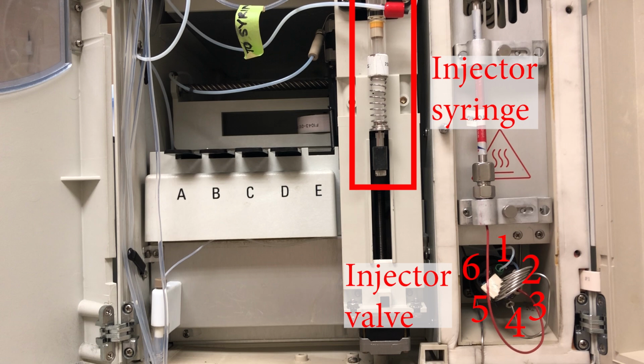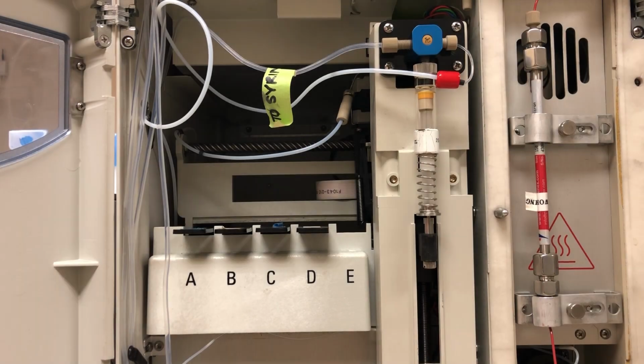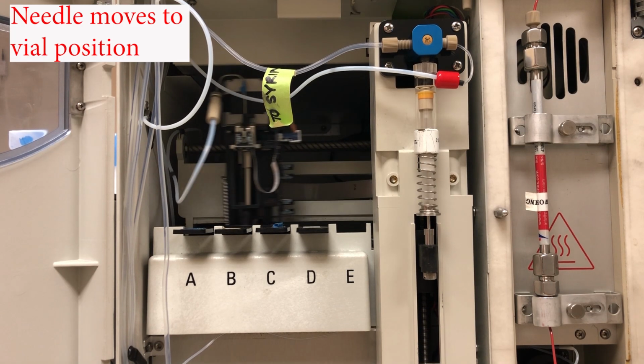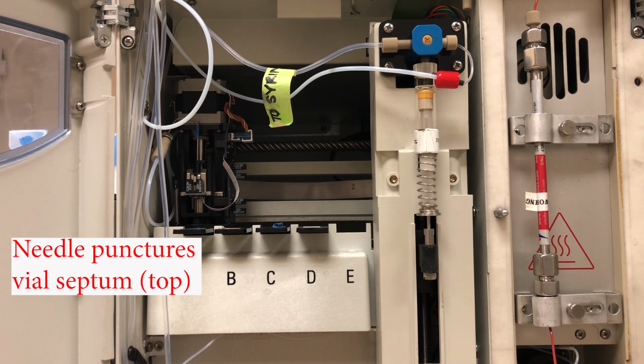We have positions 1 through 6, just like we saw. And then we have this injector syringe. So we're not going to put a syringe in a loop by hand. We're going to have this guy do it for us in an automated fashion. So let's watch this happen. So first, the needle moves to the vial position. It punctures the septum in the vial. So I put it in A1, position A1.